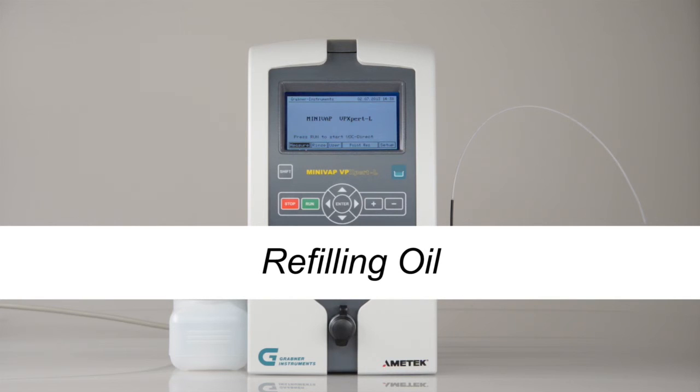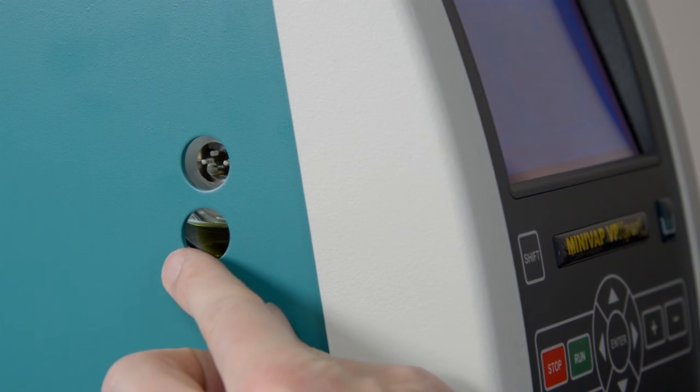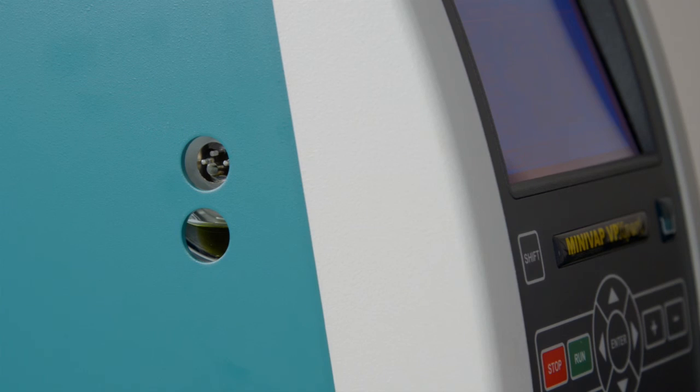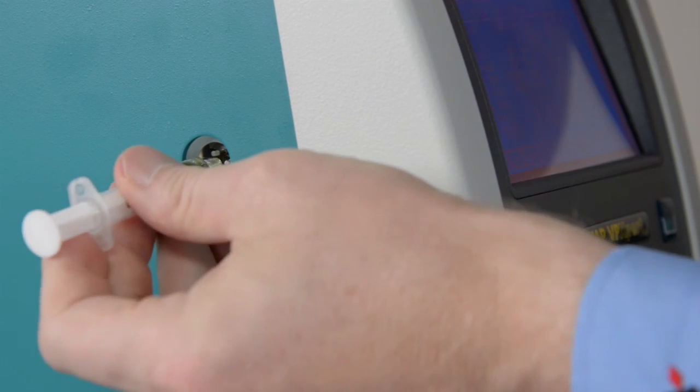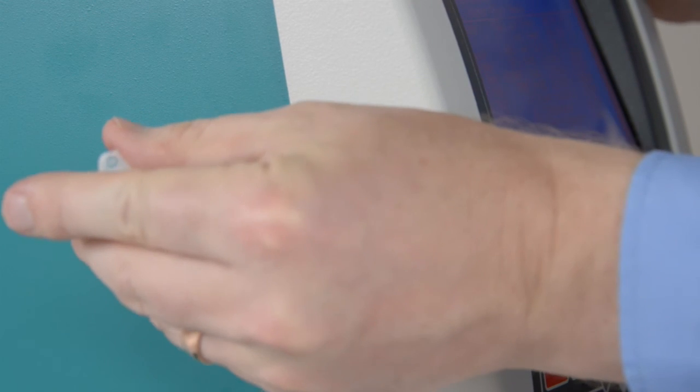Refilling oil. From time to time, you may need to check the oil level of the automatic piston lubrication through the lighted window. The oil should fill the bottom reservoir of the oiler. If it is less, refill about 0.5 milliliters of the piston oil which was delivered with the instrument.